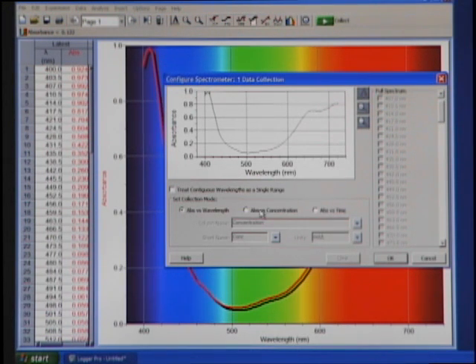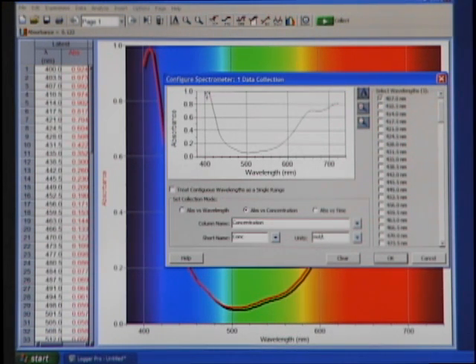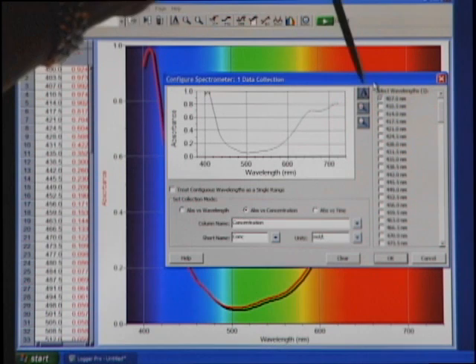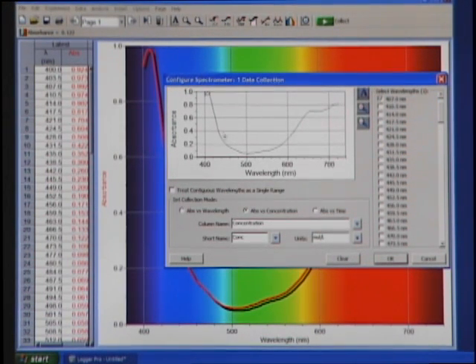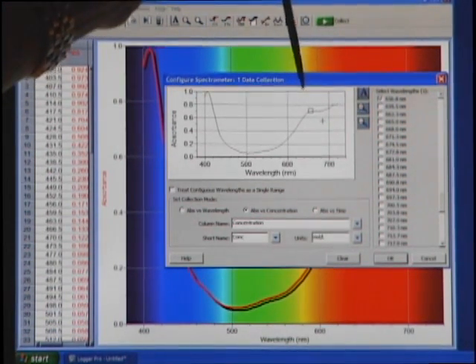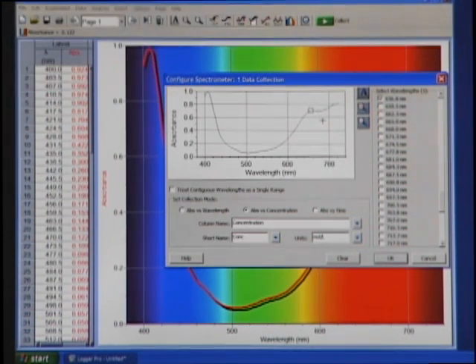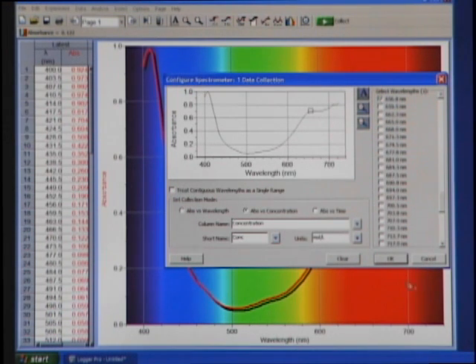And now I have a dialog box that gives me three different modes that I can use. There's absorbance versus wavelength that I'm currently in. There's absorbance versus concentration, which is what I actually want to do for Beer's Law standards. And then finally there's absorbance versus time for a time-based experiment. So what I'm going to do is click on absorbance versus concentration. And what it's done here is it's actually selected for me a peak that's down here at 407 nanometers. But I can also choose a different wavelength. So maybe what I'll do here is I'll uncheck the 407 and I'll go over into that red region, which also works, and maybe take this little peak right here and just click on that. Notice that it's left a little square point protector on that peak. And now up here I have select wavelength checked at 656.8 nanometers. I like that choice, so I'm going to go ahead and click on OK.